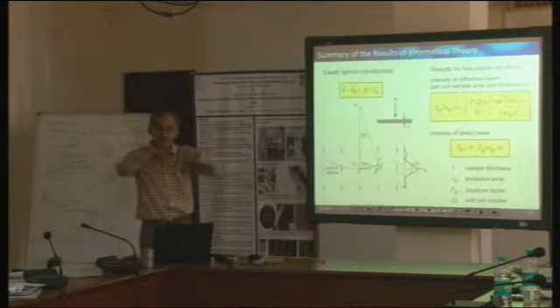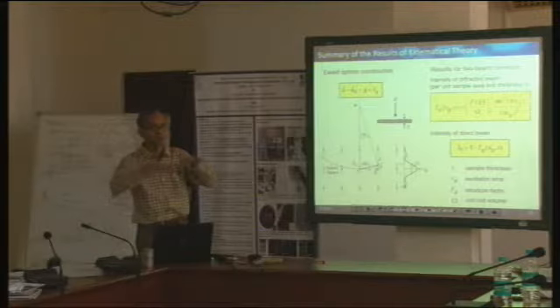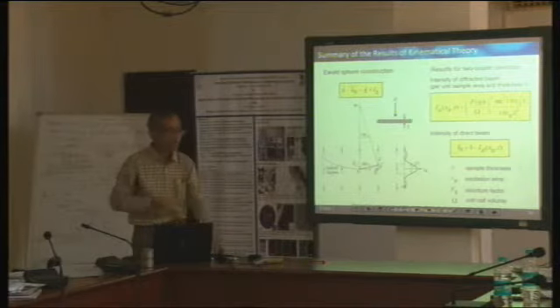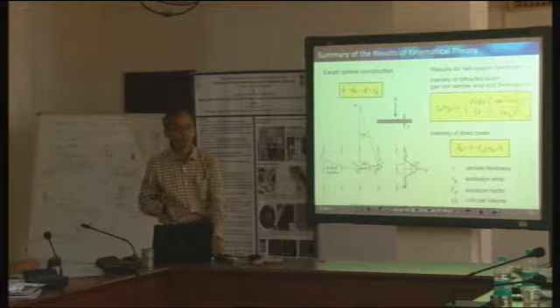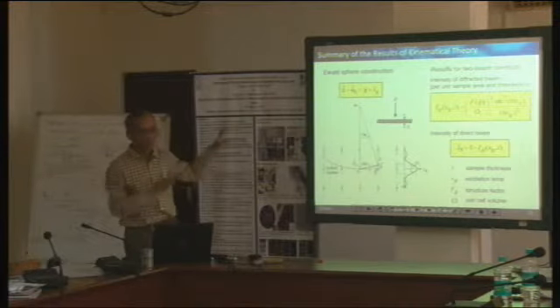Although my sample contained no defects, it was actually a uniform defect-free sample, it was made thin, which I usually do when I prepare a TEM sample. Because I made it thin, it got bent locally, and because of that local bending, this equation played out and the intensity varied locally. This contrast is called bending contours. We will see how they look and all that. That's one thing.